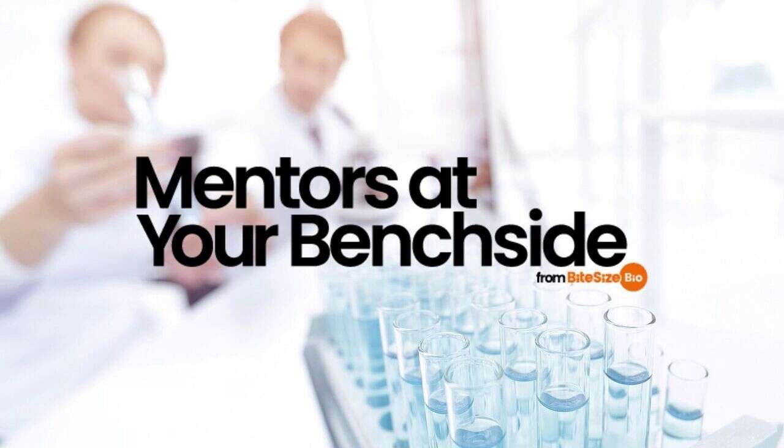Now, we know you might have some questions about using Ponceau S, so here are some frequently asked questions. How many times can I reuse Ponceau S stain? This depends. Generally, you can use Ponceau S until the signal strength is noticeably lower. If you notice the strength is weaker, discard the old solution and replace it with a fresh one. How should I dispose of Ponceau S after staining? You should dispose of the stain following your laboratory's protocols. If you're not sure on this, ask a senior member of staff or your safety officer.